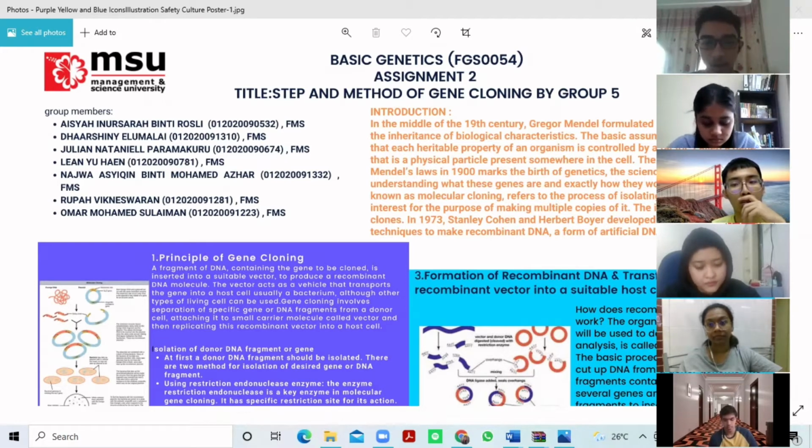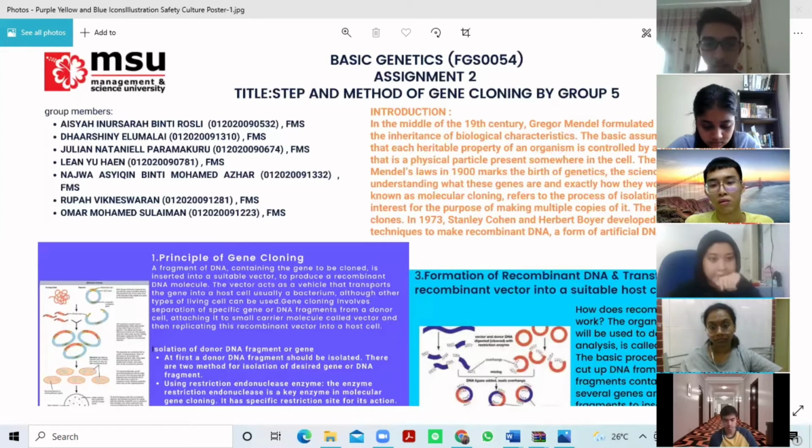So once the DNA is extracted, it is added with this restriction enzyme. If the enzyme added is restriction endonuclease enzyme, it will create sticky ends where it has acted upon. This means that at the area which is cut, it will create two separate ends which contain the necessary gene. So how it works is that it is able to detect a specific sequence of DNA and only cut at that area. So because of this factor, we need to use the same restriction enzyme later.